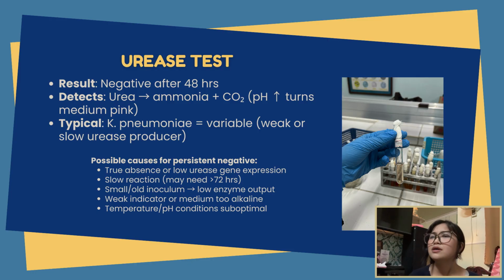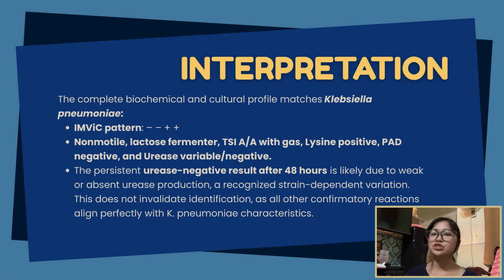Therefore, even though my urease test was negative after 48 hours, the result still aligns with Klebsiella pneumoniae when considered with the other confirmatory tests such as the IMViC, which was negative, negative, positive, positive, the TSI, which is A over A with gas, and non-motility. To summarize, the biochemical pattern I obtained in IMViC was negative, negative, positive, positive, non-motile, lactose fermenter, lysine positive, and TSI A/A with gas, which is consistent with Klebsiella pneumoniae.